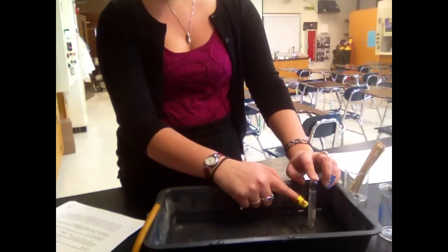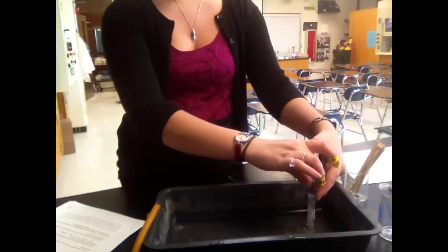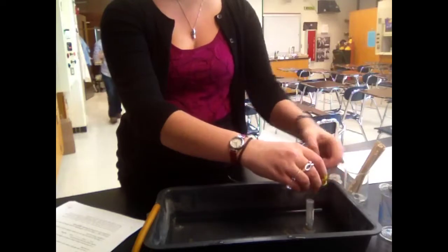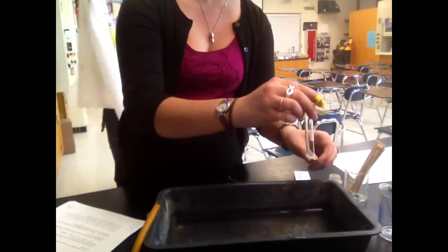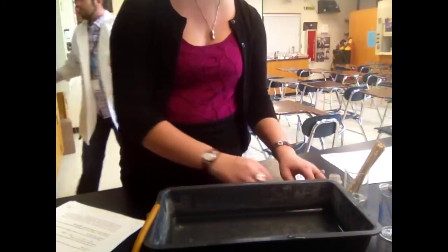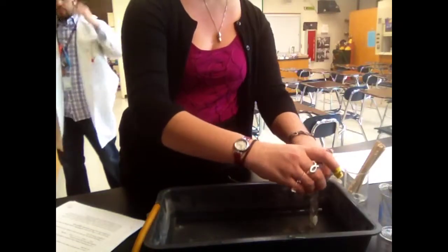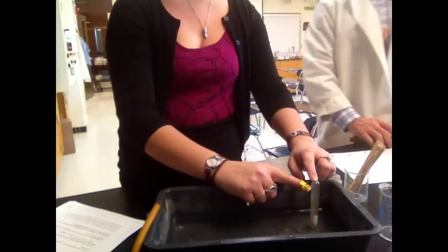Okay. It's almost there. You can see the water level go down as the gas fills up the test tube. So right when it gets right here, I'm going to lift the test tube up, allow that leftover water to fall out, and cork it. And then I'm going to take my final test tube and only fill it up about 1/12 with the acetylene gas. So right about here.